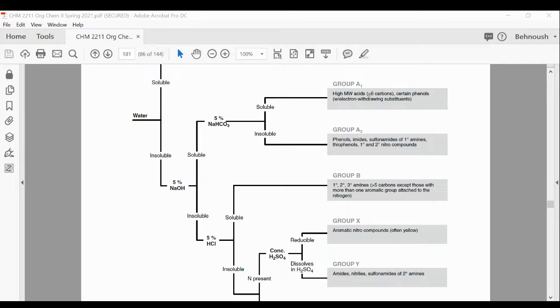Okay. Now we have another test tube that we don't know if it's phenol or is benzoic acid. What would you use? Which solubility test would you use? Phenol and benzoic acid. Sodium bicarbonate. Very good. Can you tell me what would be the evidence? How would you know if it's a phenol or the benzoic acid?